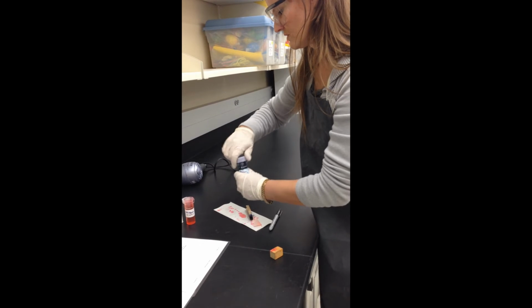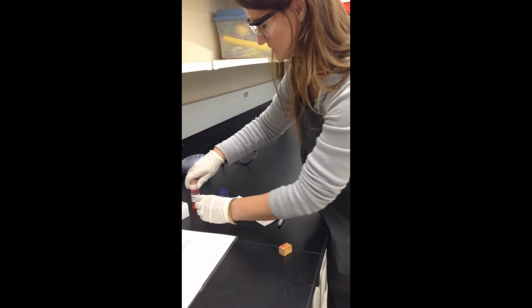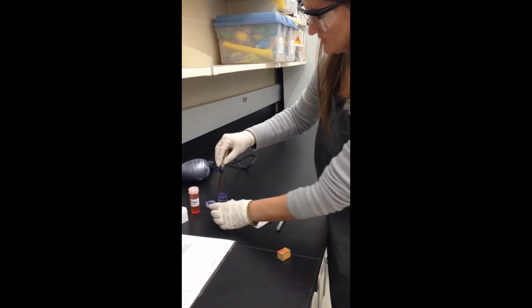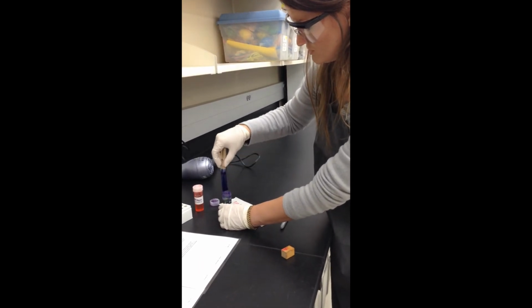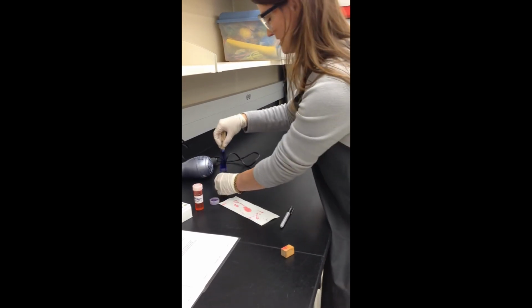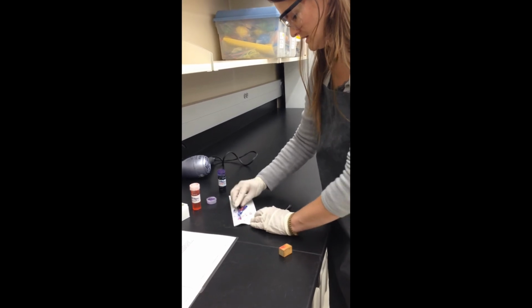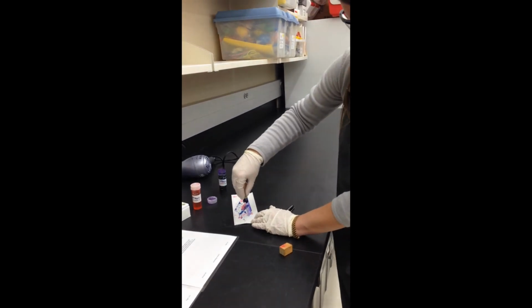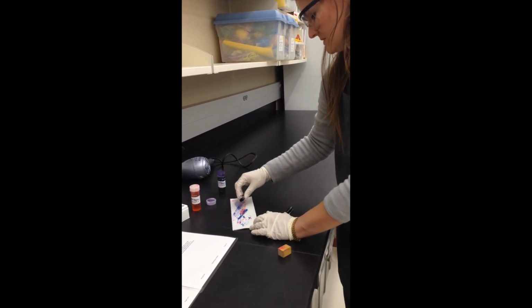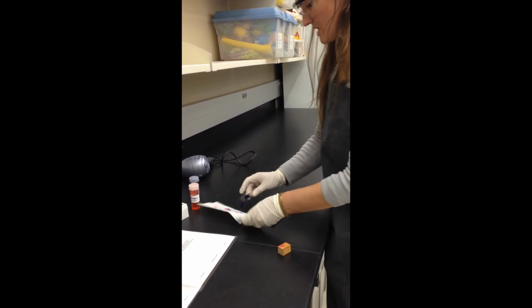Alright, so then we'll move on to stain 2. Probably wise for you to go ahead and close your stain 1 so you don't knock that over. Those stains will stain your clothes. Okay, so we go stain 2, 1 second, repeat, 1 second. Okay, and we'll get the excess stain off of this slide by letting that run down. Okay, so we'll close up this stain.